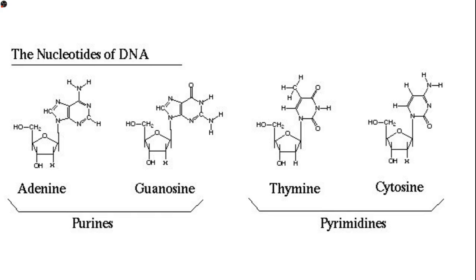NGS parallelized the process of sequencing, so it has given us the ability to sequence from a million to a billion DNA molecules simultaneously in one cycle. It has revolutionized the entire field of research. It has given rise to various fields of research like personal medicine, genetic diseases, diagnosis, and clinical diagnostics.